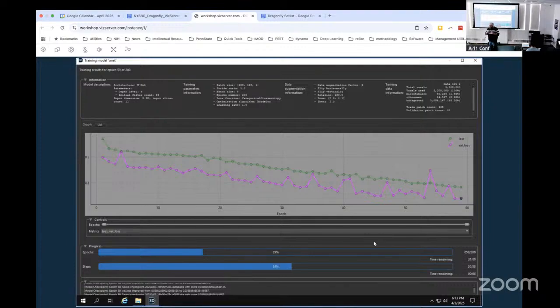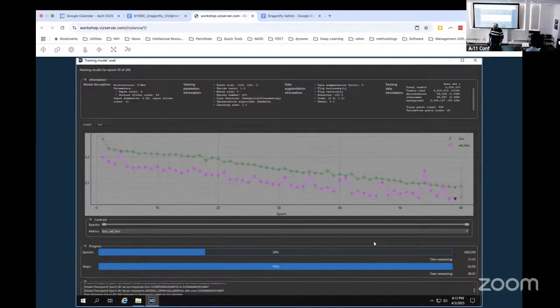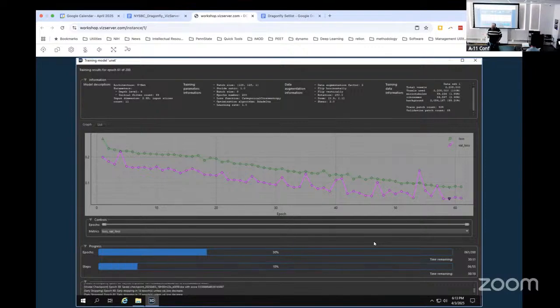Yeah, okay. Sometimes it can. But those are my own, I don't want to wait for the process. It's kind of very unoptimal. I think it's not proprietary technology. No, I don't know, I would put it with one of their reports in a way that allowed me to look at it.